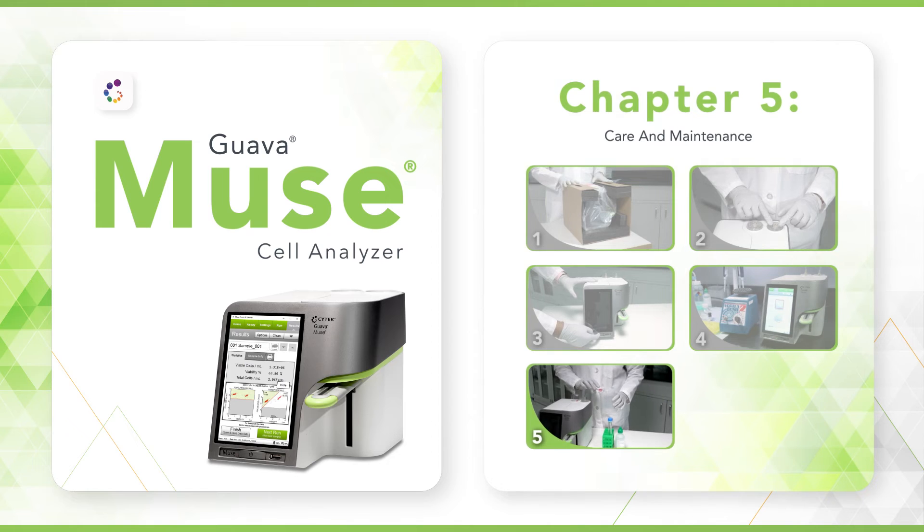This chapter covers key cleaning and maintenance steps to ensure fast setup, optimal operation, and the longevity of the Cytec Guava Muse flow cytometer. For optimal performance of your Muse cell analyzer, it is critical you adhere to the recommended guidelines for setup, maintenance, and shutdown.